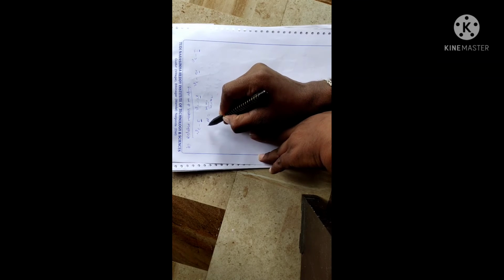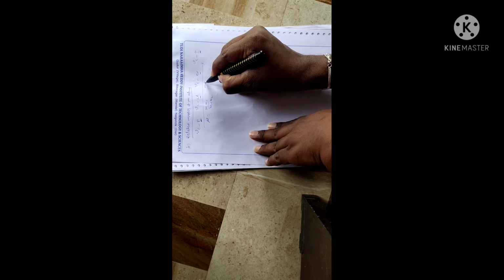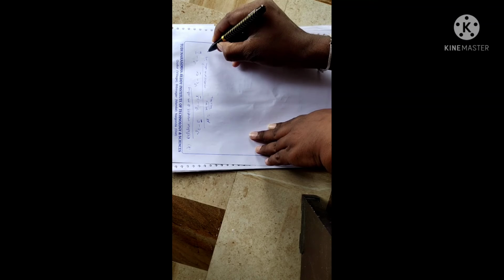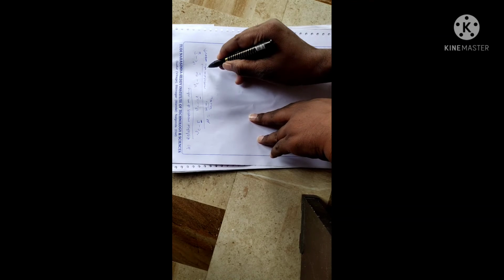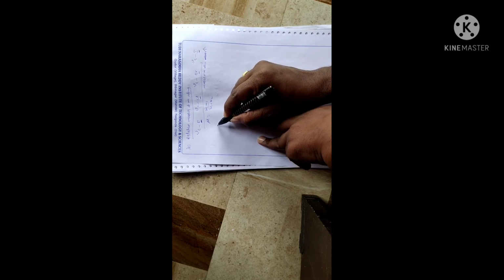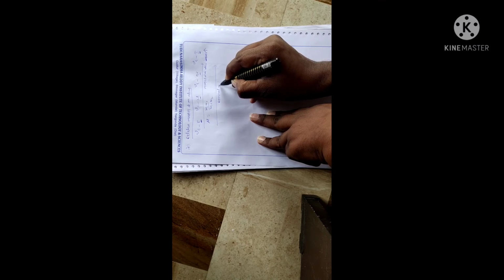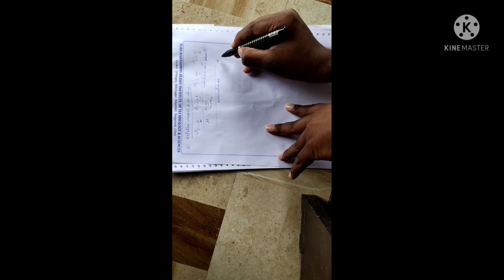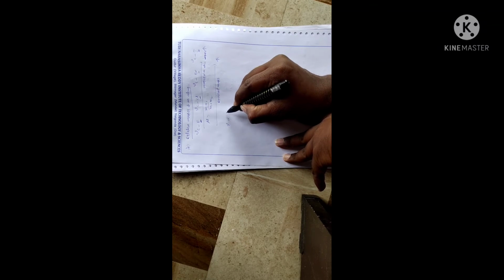And is the frequency inversely proportional to the reduced mass?